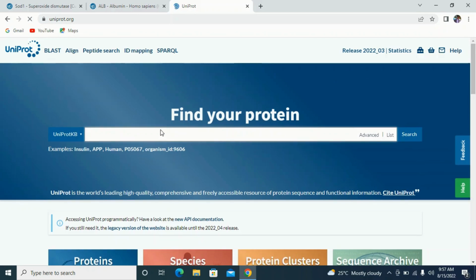So this is what I have. This is the particular protein I want to model. I have the uniprot code. Every protein, once the sequence is known, will always have a uniprot code, or uniprot ID. Search for the uniprot ID, or if you wish to search with the name, you can, only that the name will expose you to several options. But once you have the ID, it will take you specifically to that particular protein of interest.